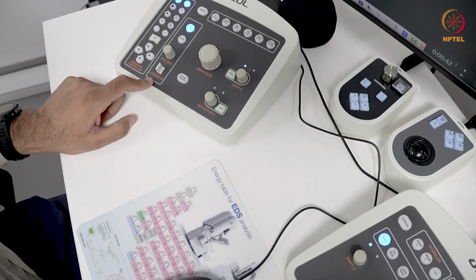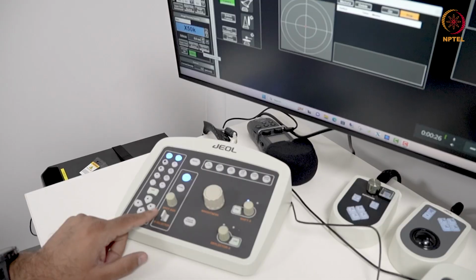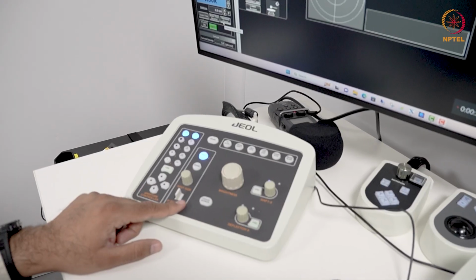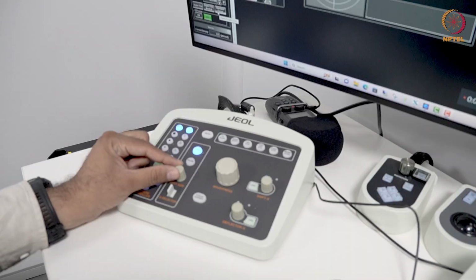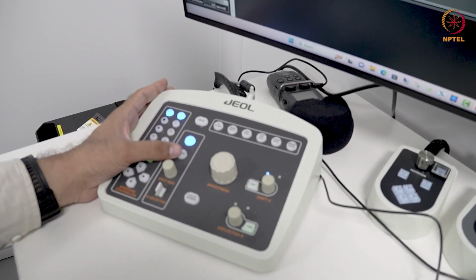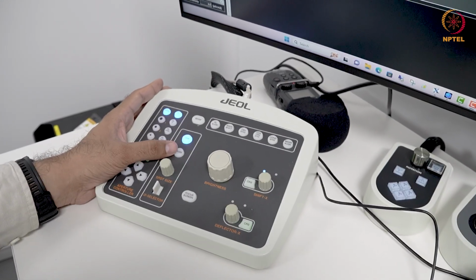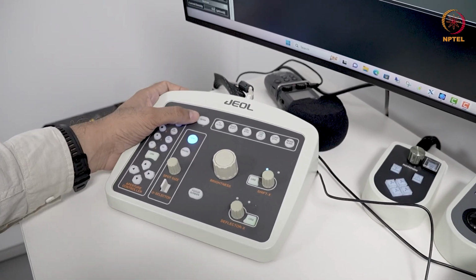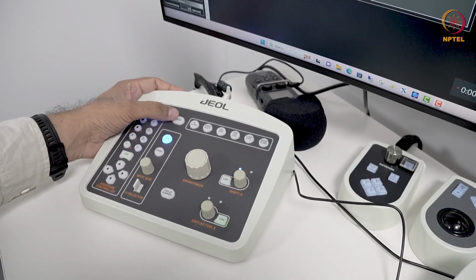You can select the convergence angle here. There are different alpha values that you can change. So when I change this alpha selector, I can go from either alpha 1, 2 or 3, where I change the convergence angle. This is to select the spot size of the beam that I'm actually using. And this is to switch between the TEM mode or the probe mode. Depending on what kind of analysis you do, whether you require a probe or a broad beam parallel illumination, you need this.